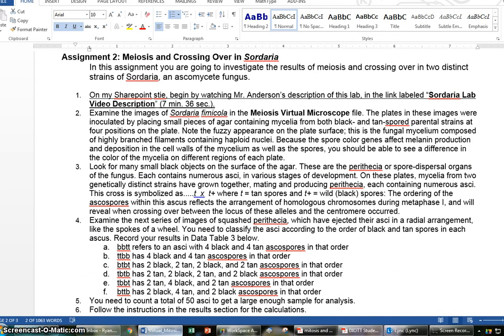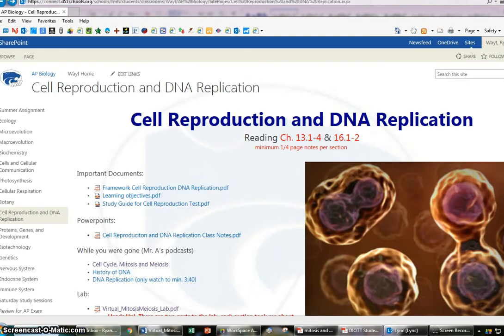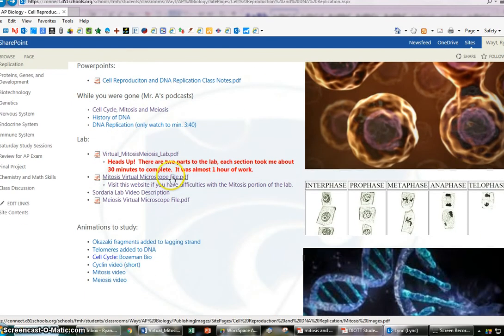And then let's talk about part 2, meiosis and crossing over in Sordaria. So let me explain this really quickly. When you go back to my website, I do ask you in the directions to watch this video first. This is the Sordaria lab video description. Mr. Anderson will give you a complete description of what's going on first.